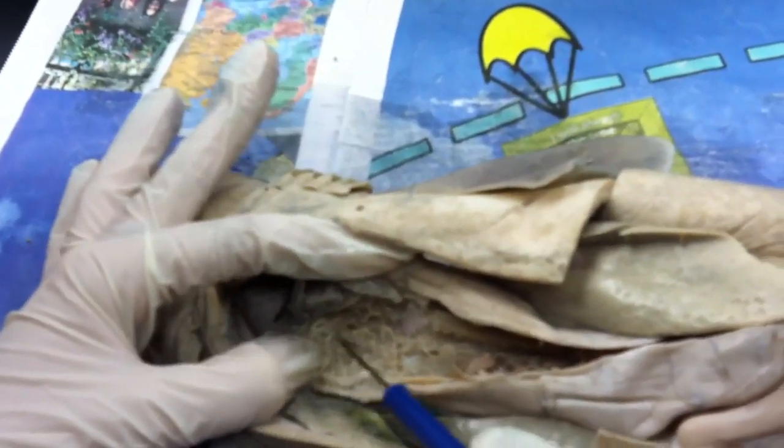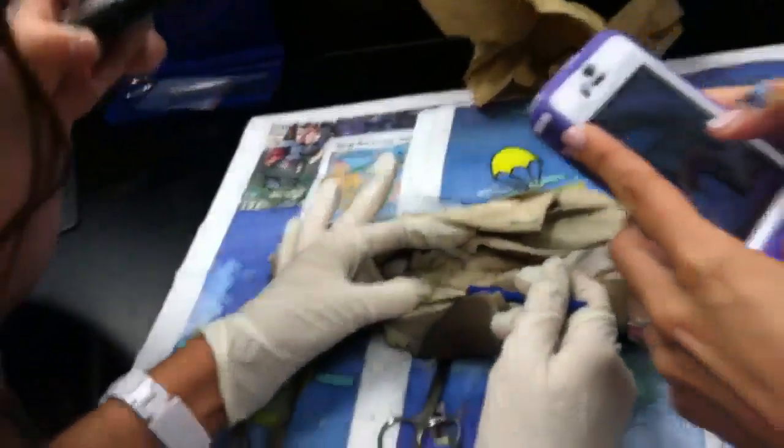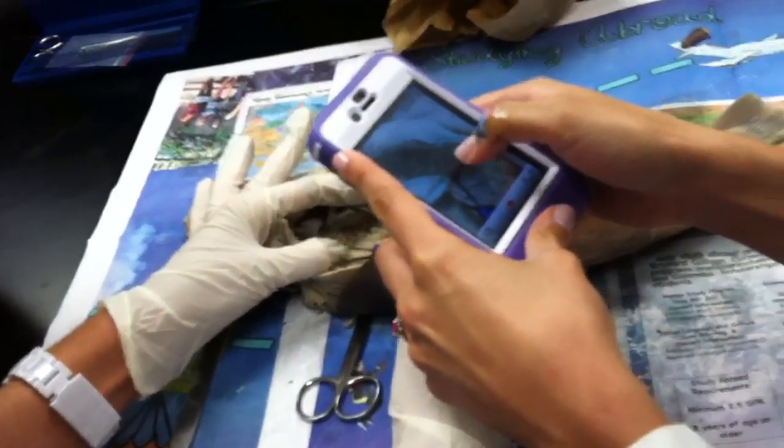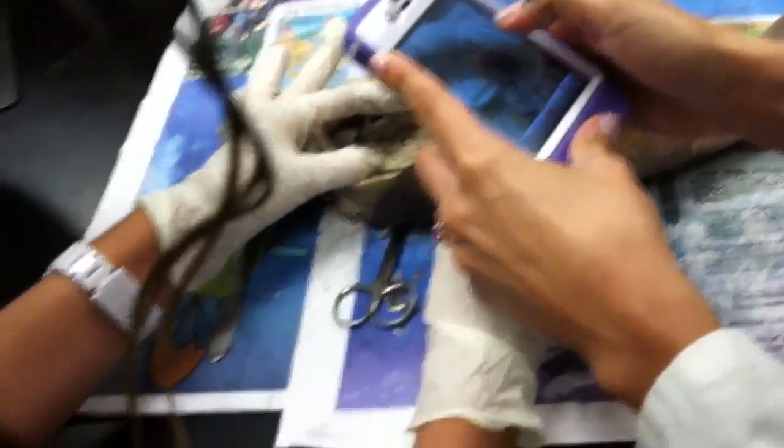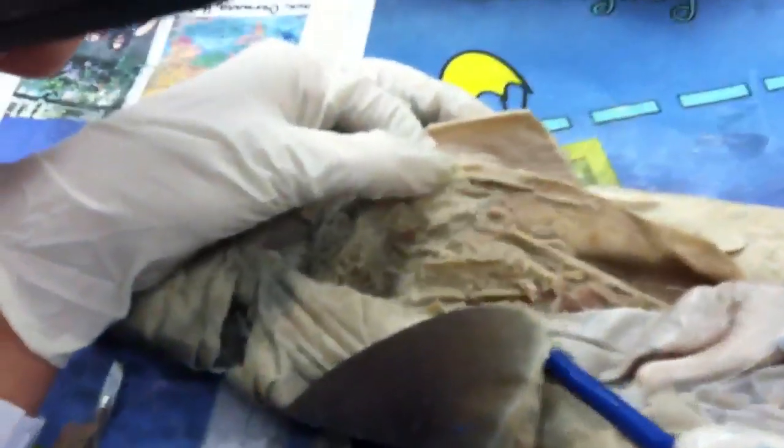Papulae — there are little white projections in the esophagus, can you see those? Those are papulae. Rugae are the folds in the stomach — see these folds? Those are the R-U-G-A-E.